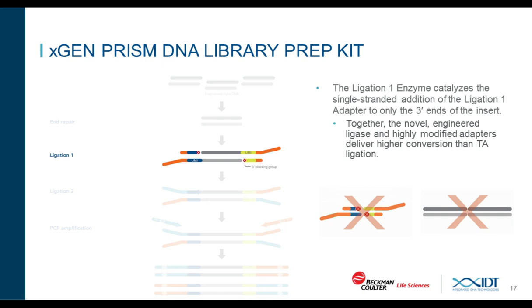Additionally, single-stranded UMI sequences are added to the insert, which you see in dark blue and light green, and they're labeled with a UMI. This unique single-stranded ligation to fixed UMIs enables strand-specific molecular indexing by independently tagging the top and bottom strands.